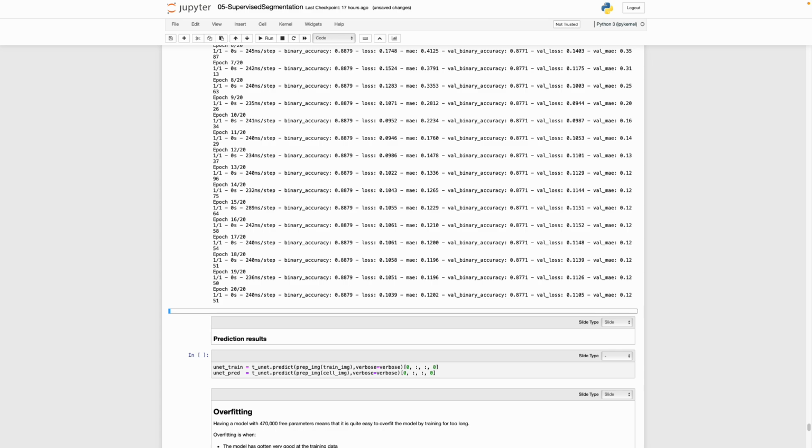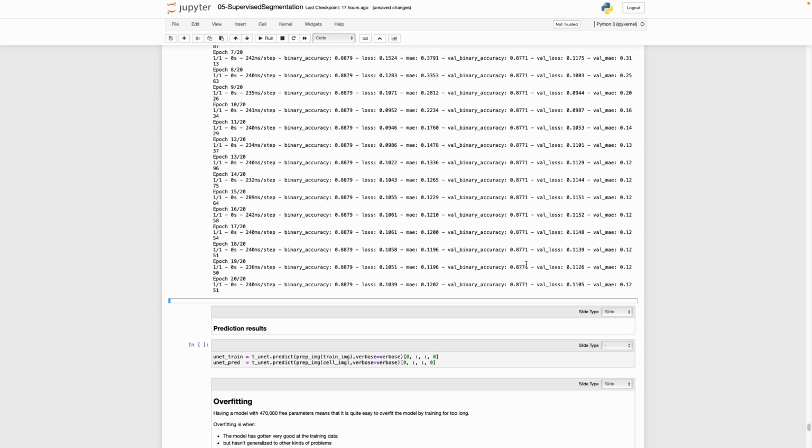What it does under the hood is quite a lot. Honestly, I can't tell exactly what it's doing, but it's the best optimization you can get from the network it has and the data it has, and then the next epoch takes the same training data, but with the new weights, and tries to do the best out of that. So that's the task of the optimizer, and by iterating that many times, you get closer and closer to something that you can trust.